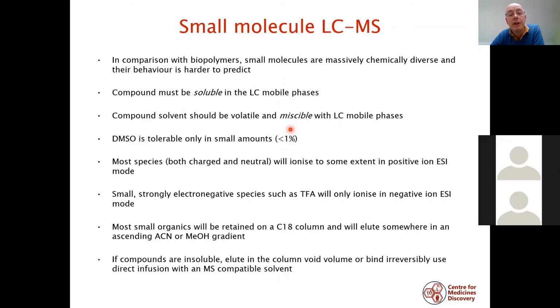Most species, whether they are charged or neutral, will ionize to some extent in positive ion mode. It doesn't really matter what the charge is; most species will ionize. There are one or two that will not. Very small, very electronegative species will not ionize in positive ion mode, and you will have to use negative ion mode.